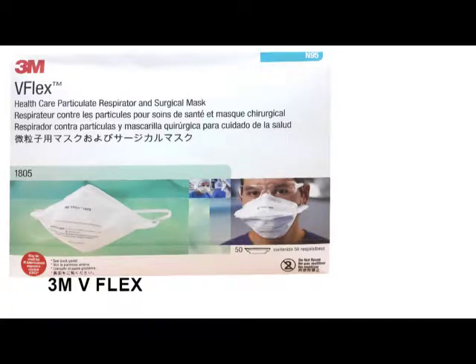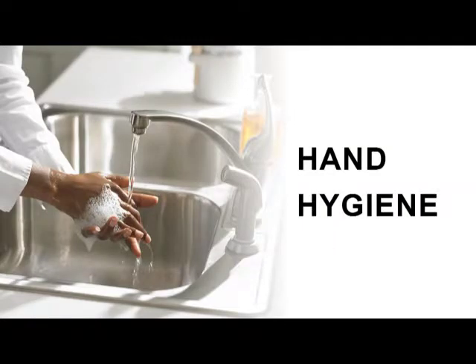How to properly don and remove 3M V-Flex N95 respirator. First, perform hand hygiene.